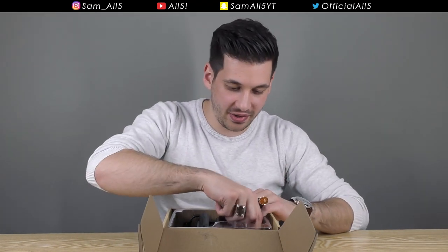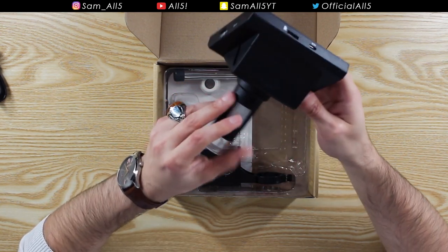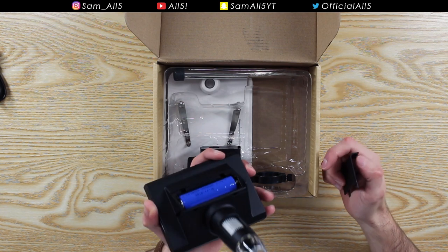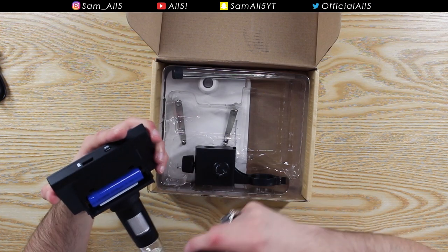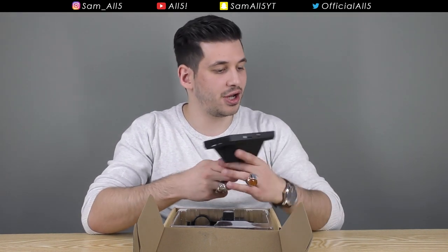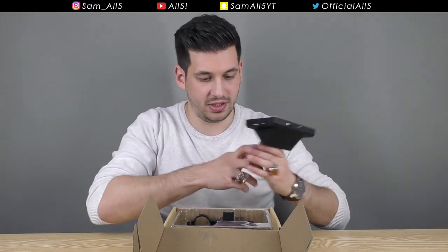There's an instruction manual — pretty standard stuff. Here is the microscope and the screen itself, and that actually doesn't feel too bad. It has some sort of compartment — it takes standard batteries, which is nice. There's an SD card slot, and a DC 5V port for charging, so the USB cable is actually to charge the device.